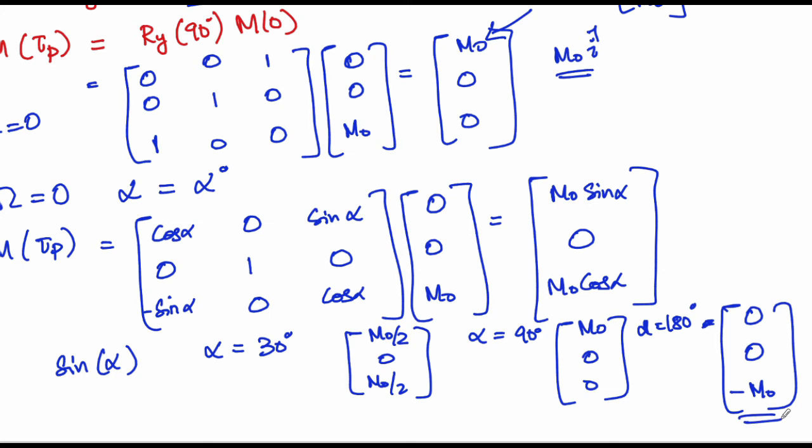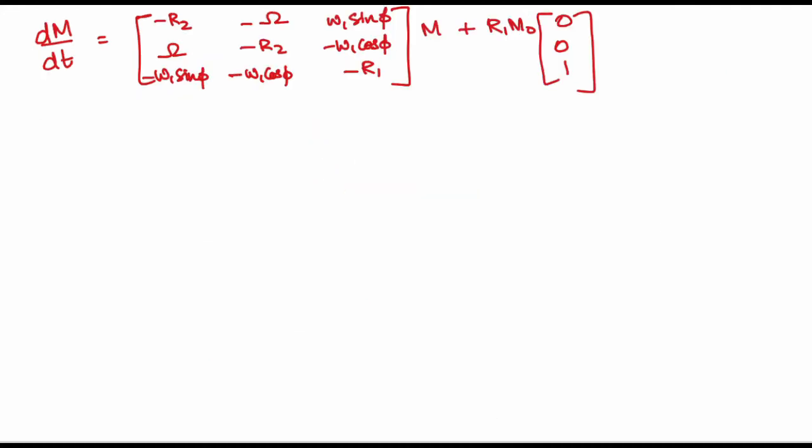So what you are seeing here again with the Bloch equations is that you can understand that the magnetization ends up being rotated by the pulses that you apply. But this is not surprising because the magnetization ends up precessing about the B field that you have applied. And of course, once you acquire a signal, let's say after a 90 degree pulse, this is what you started with: t equal to 0, which gives you M plus of 0 equal to M naught.